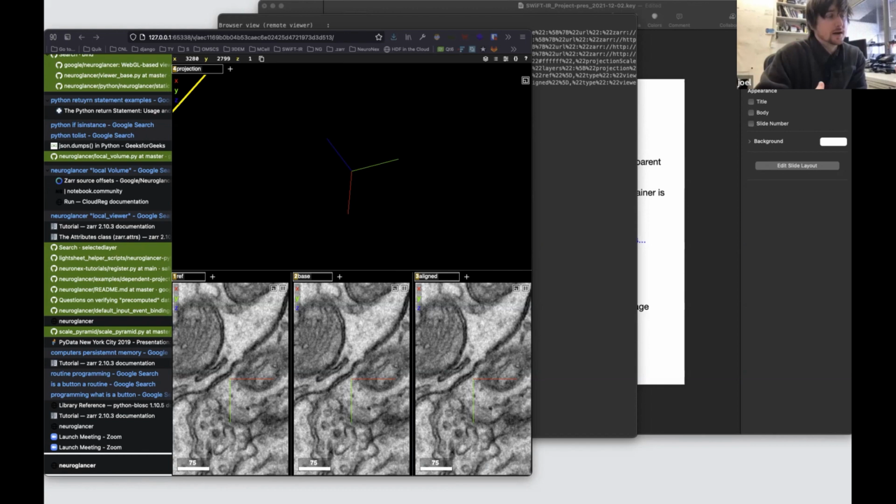And also you only want the chunks from that image. So you're traversing image scales. You're also, as you move in a two-dimensional plane, moving to different chunks, and you're only being served the chunks that you want when you need them. And that's the technology that underpins Google Earth, as Thomas mentioned before, right.